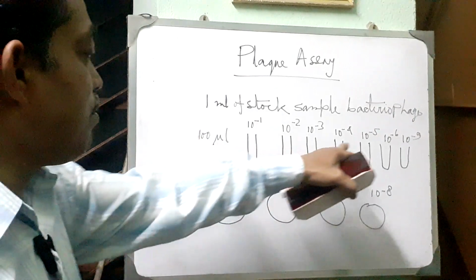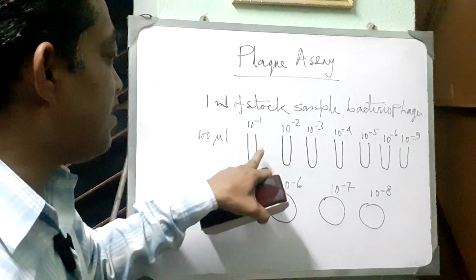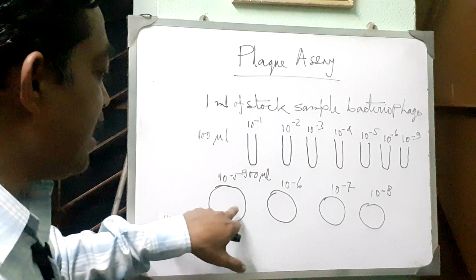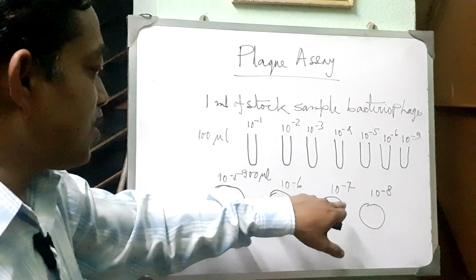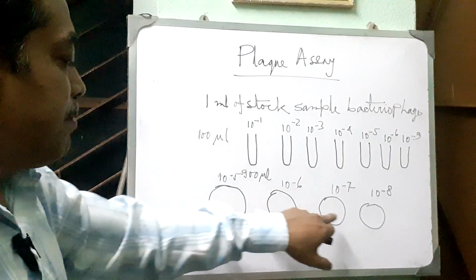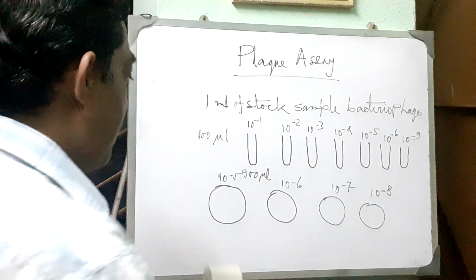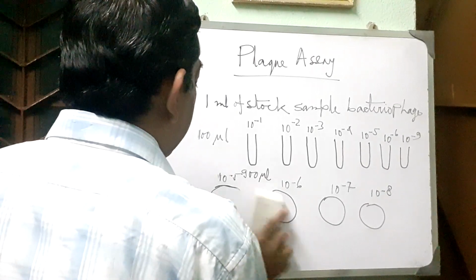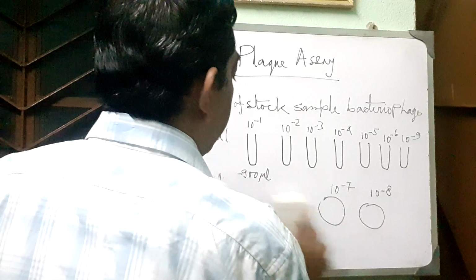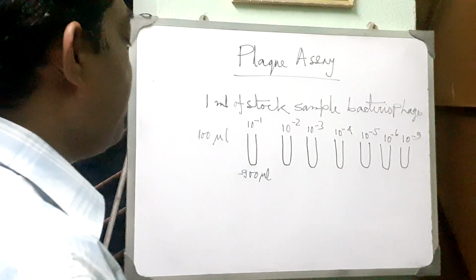Now this dilution series has been prepared in the sterilized trypton broth. You have also made the sterilized agar, solidified as blank plates of trypticase soy agar or trypton agar. Now what will you do?